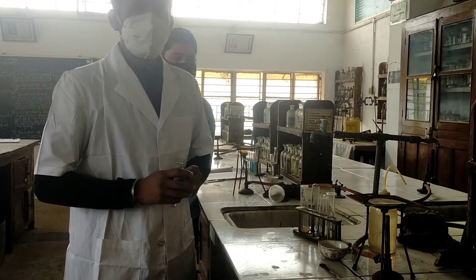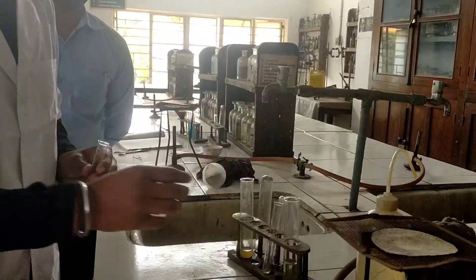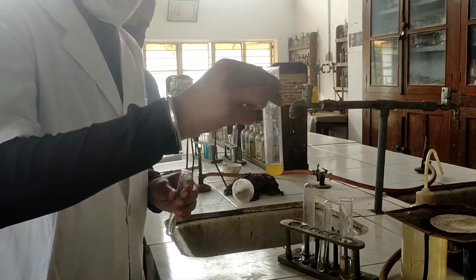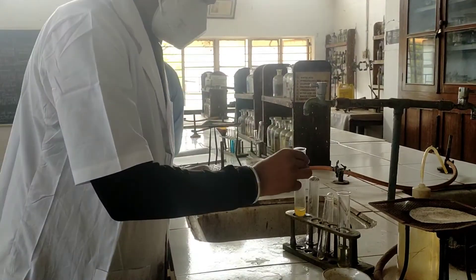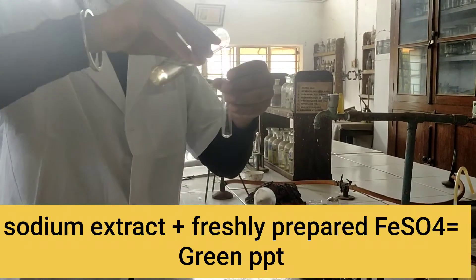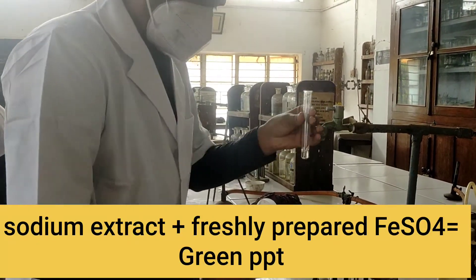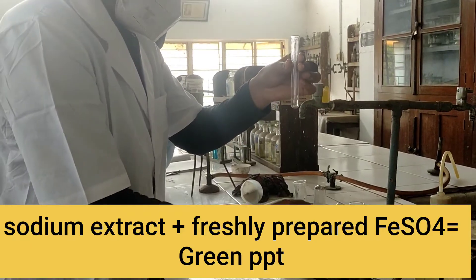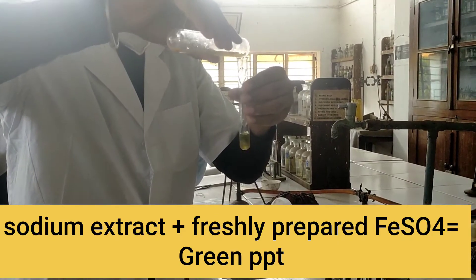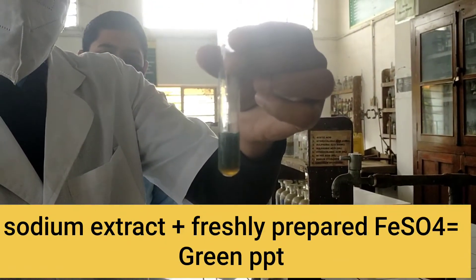Now, we are ready for our element detection test. First, we have to test for nitrogen. For this, we will require our sodium extract and freshly prepared FeSO4 solution. In a clean test tube, take 2 ml of sodium extract and add freshly prepared FeSO4 solution. Here, the green precipitate is formed and this shows the presence of nitrogen.